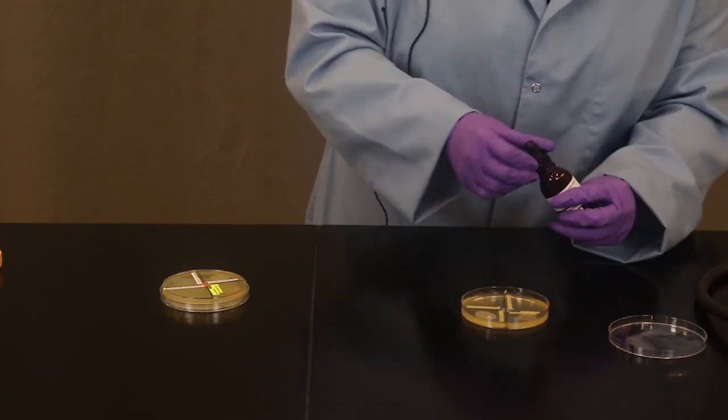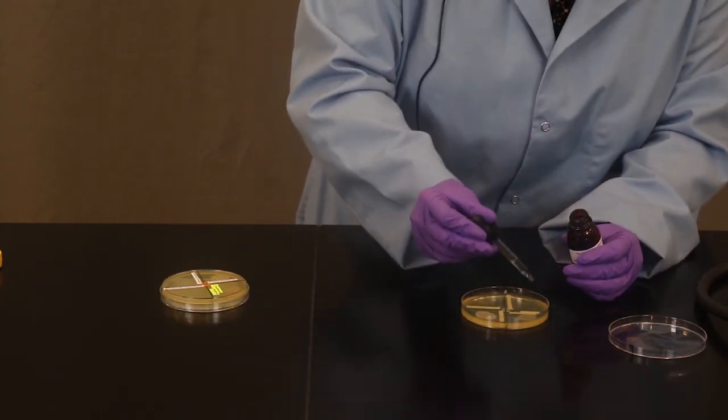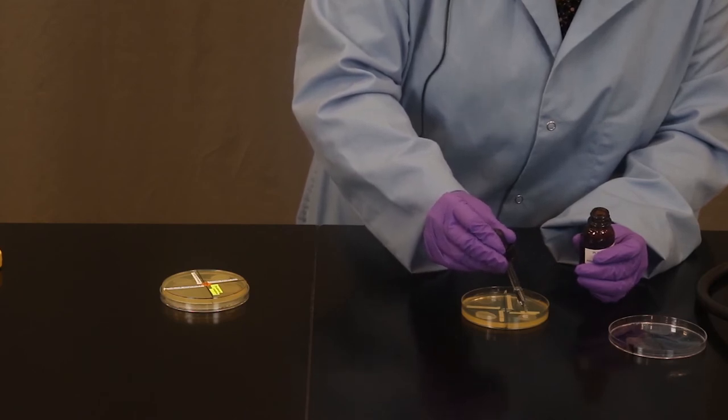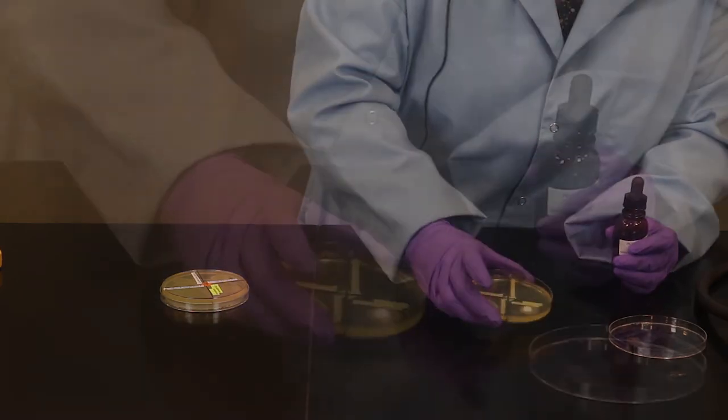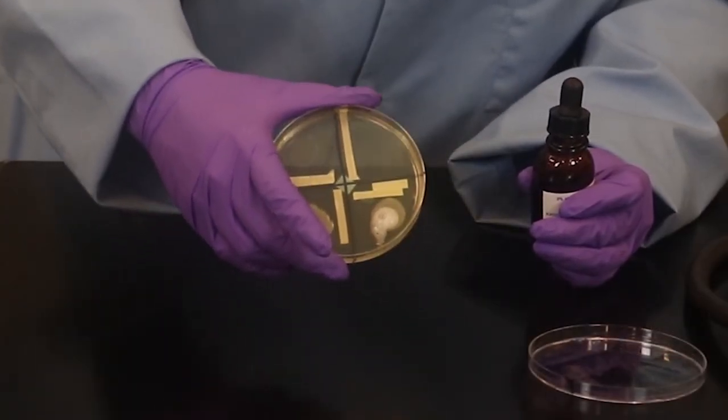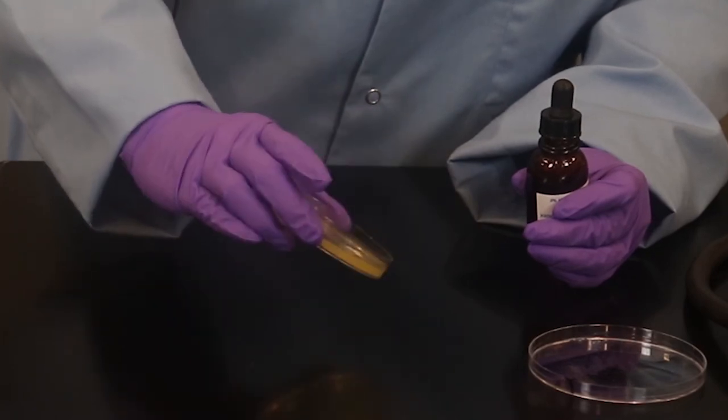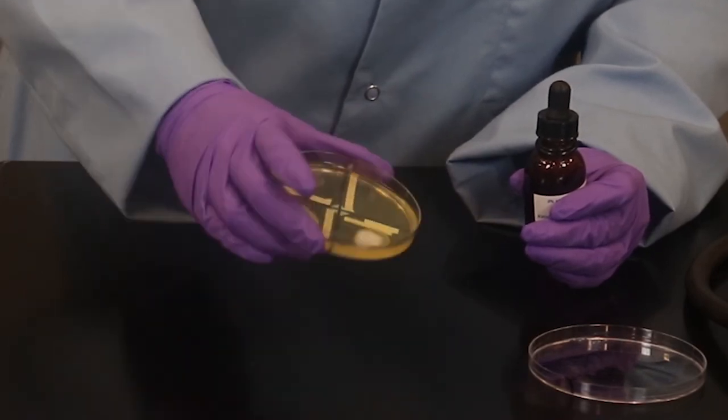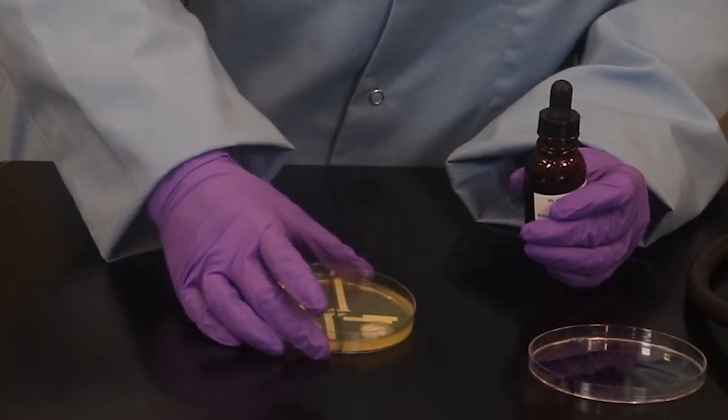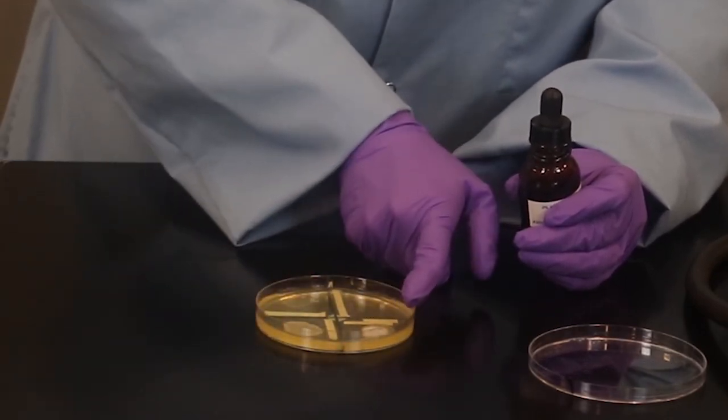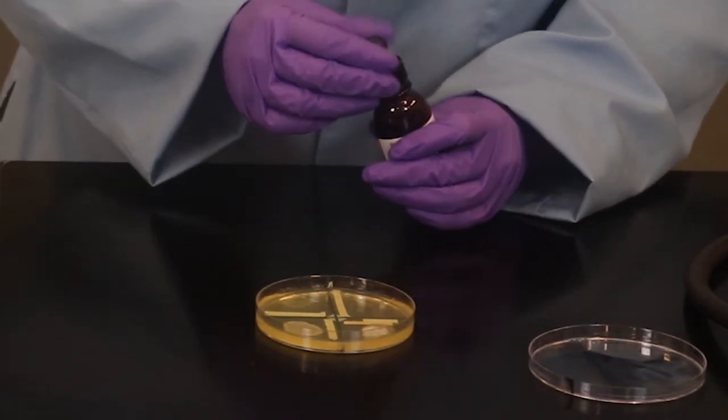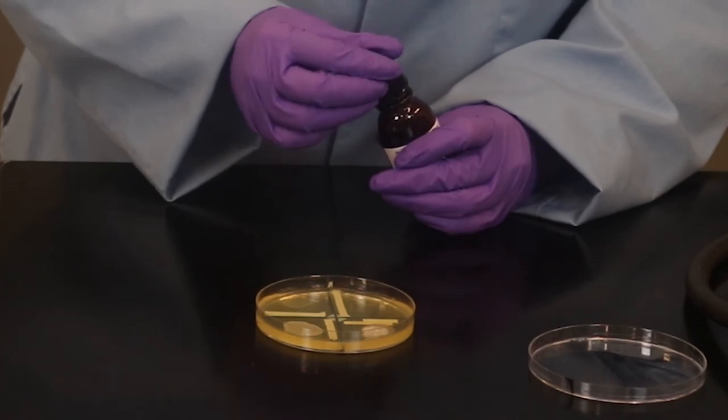And all I'm going to do here is take my hydrogen peroxide and place a drop, a couple drops. I don't know how good you guys can see this, but there's lots of bubbling. When we see the presence of lots of bubbling, that indicates that catalase is present. It makes sense because Pseudomonas grew aerobically, and it has the catalase enzyme. And that helps protect it in an oxygen environment.